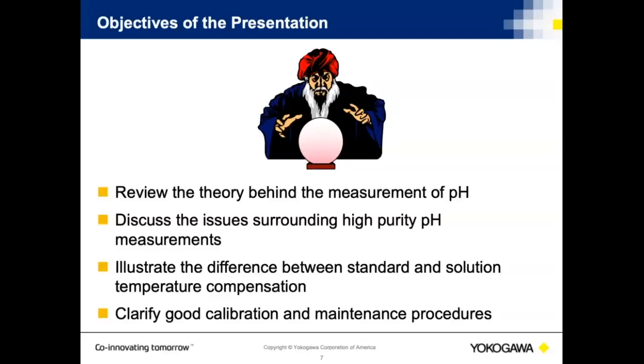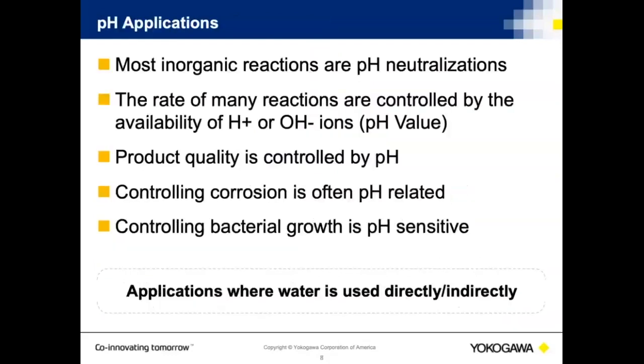So again, as Christina already hit on, we're going to review a little bit of the theory. We're going to discuss some issues surrounding high purity pH measurements. We're going to illustrate the difference between standard and solution temperature compensation. And lastly, we're going to clarify good maintenance procedures.